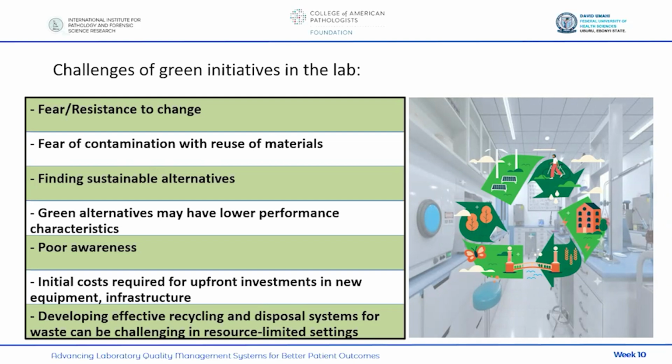Fear of contamination with reuse of materials. Yes, this is real. People can be afraid of this. Look, this is a lab. This is healthcare. If you recycle things now, how are we sure that these things will not be contaminated? Okay. The laboratories which started this also had this fear of contamination. There was one study I saw saying that yes, they had this fear, but they did a study on the use of recycled materials.